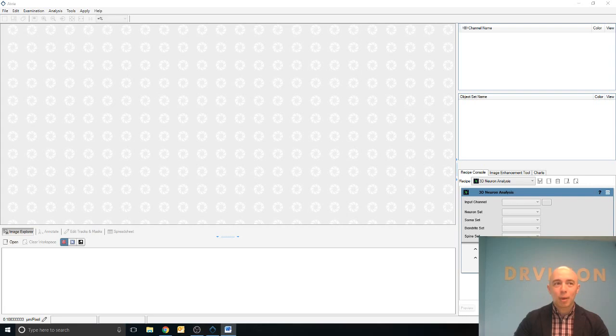Our goal in this webinar is to take a very practical approach to image and data visualization. We're going to take a look at some real fluorescence microscopy data, and we'll see some of the challenges in getting good visualizations of this data.